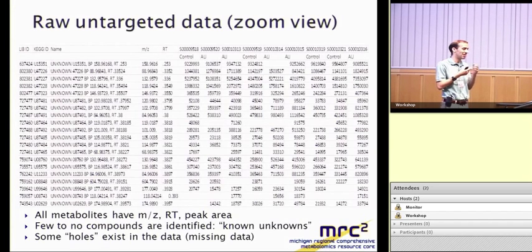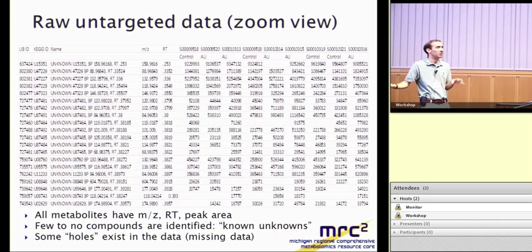Suffice it to say that the statisticians that we have in the core lab are, and also programs that I told you about, like Metaboanalyst, which can be somewhat dangerous to non-statisticians, in that you can just check a box and say, okay, I'll try this and see how it goes. They'll let you do those sort of things as well. So there's various approaches that you can use to deal with those missing data.